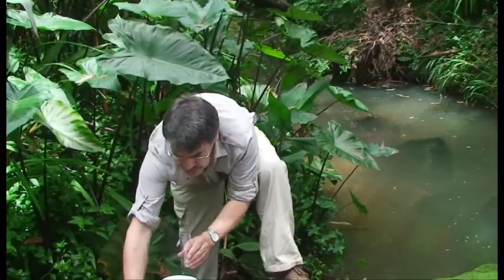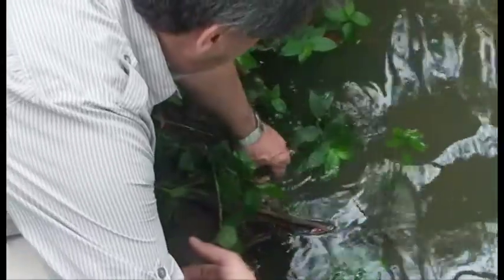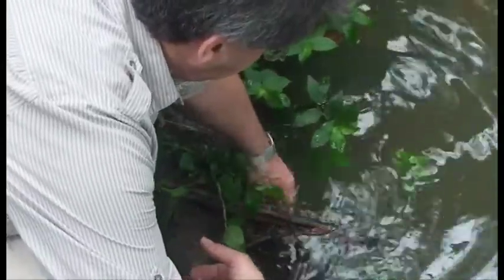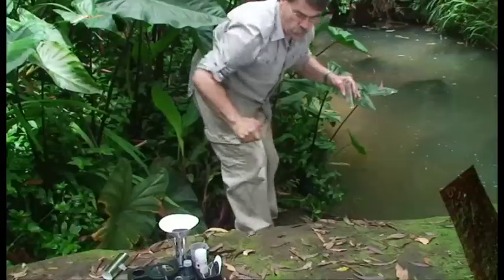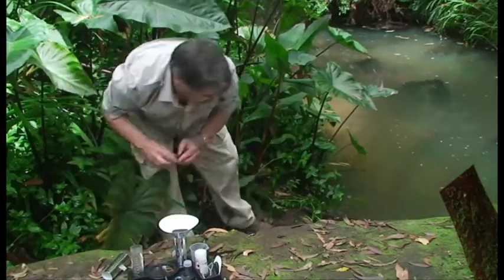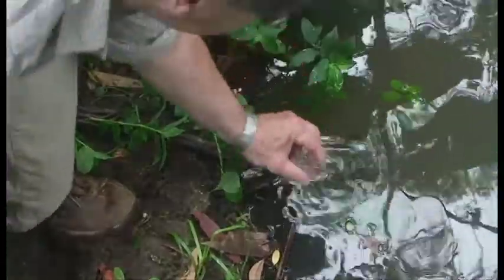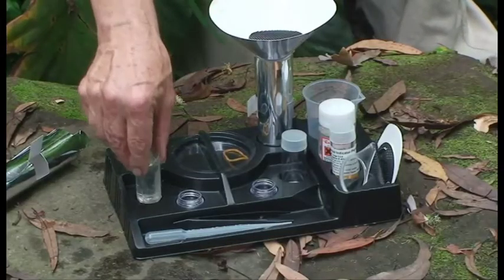I take a measuring cylinder and a sample tube, and I'm going to collect the water sample from the weedy area. Now I'm just going to collect another water sample for pH testing, which I'll put there in the kit.